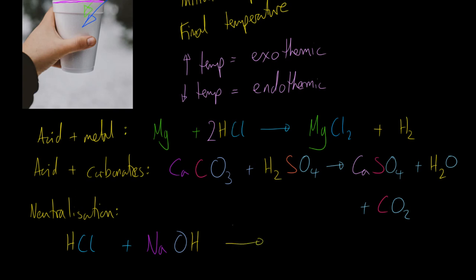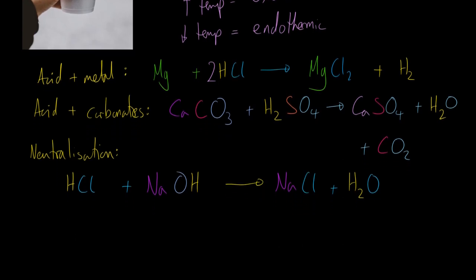And that's going to be sodium chloride, NaCl, plus H2O. So you could mix those 2 chemicals together and see if there's a reaction there. There will be, and that will be an exothermic reaction again.